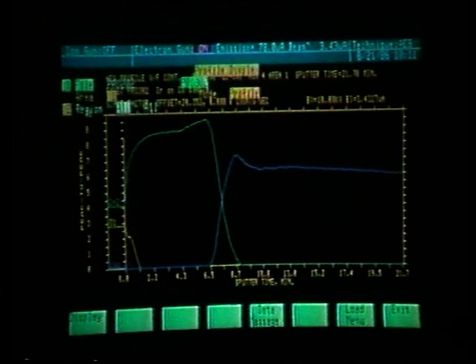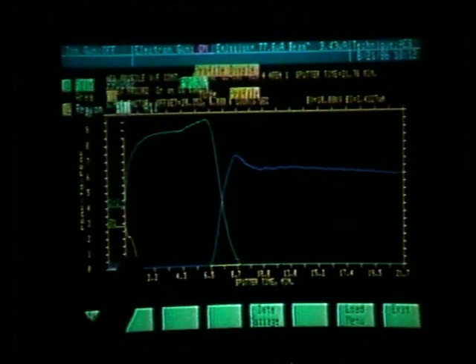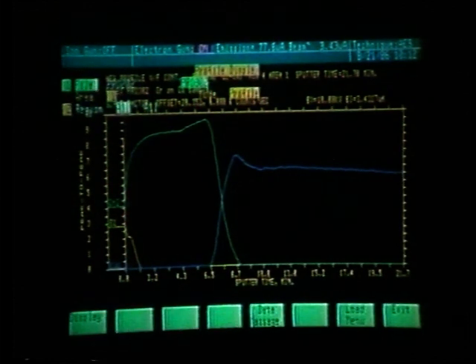I believe it took roughly 40 to 50 minutes for that data because, again, we used the alternate profile mode. The sputter time was the same, but we were not collecting data during the sputter time, so that took extra time to collect that data in between the sputtering. We did sputter for 20 minutes, as here we have sputtered for 21 minutes, but in the continuous mode the data collection time is the same as the total sputter time.